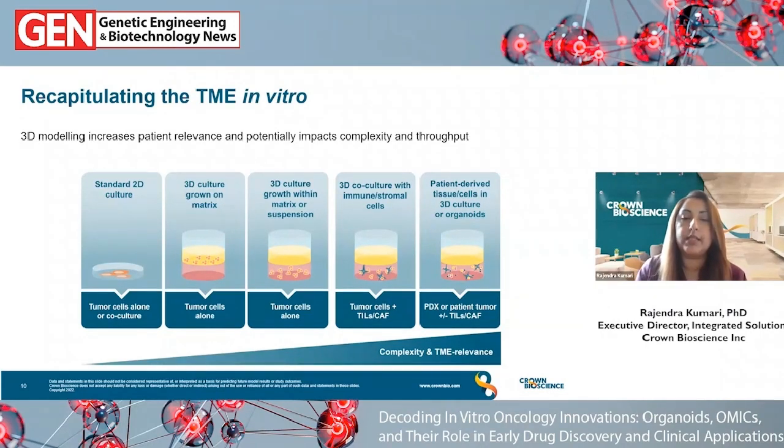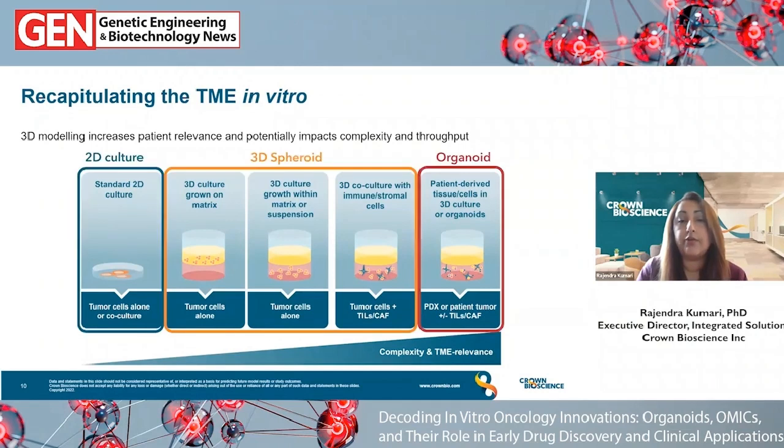So these don't necessarily mean that these will be high throughput. You can still use them for screening, but there is a limitation. And also the readouts can become more complicated with these multicellular co-cultures. So the type of analysis needs to be optimized. Now, to simplify this, I'm just going to focus on referring to them as either 2D, 3D organoids for this webinar.